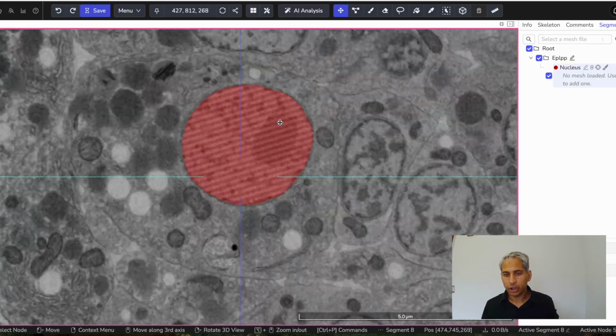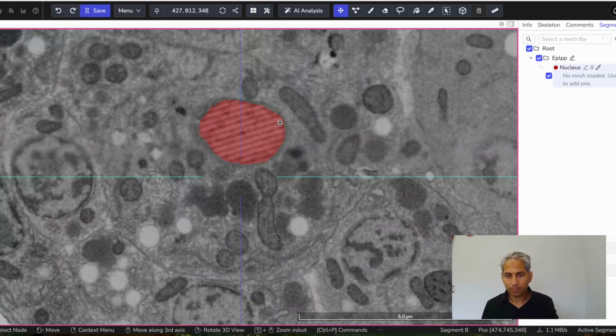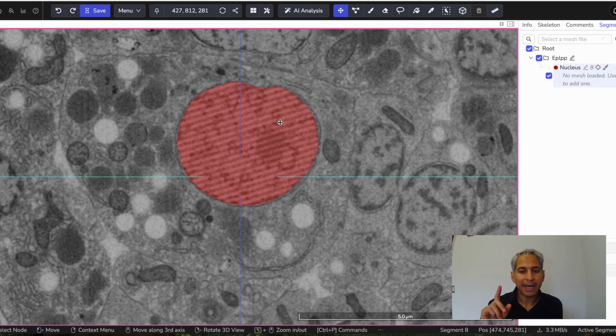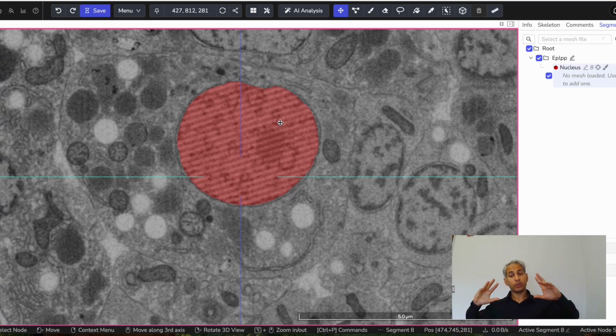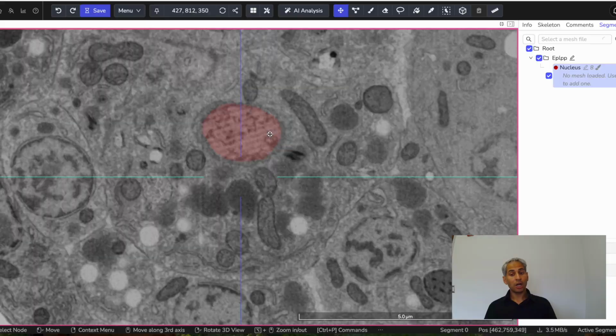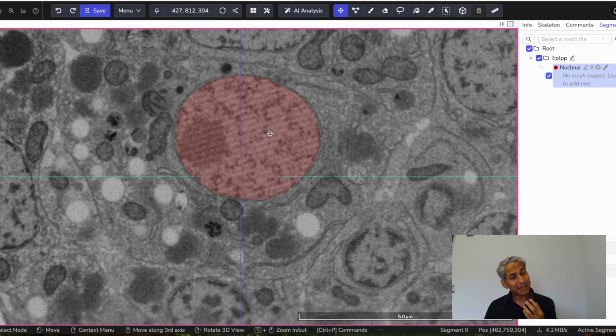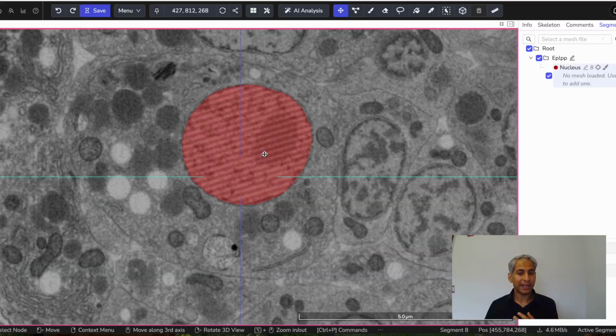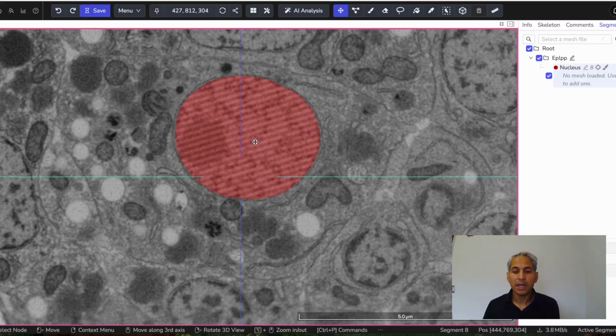Long introduction just to show you what I've already done and to highlight the importance of keeping an eye out for things that raise your eyebrows. But today we want to annotate the plasma membrane. And the first thing we do is get a sense of the boundaries of our cell. Do not rush into annotating the plasma membrane until you get an intuition of where my cell starts and ends. Okay? And then do yourself a favor.